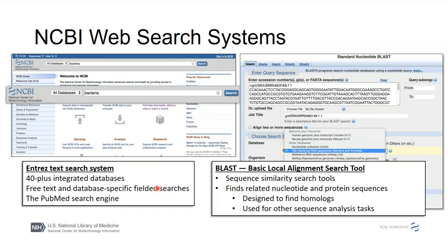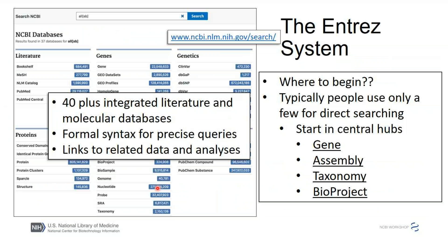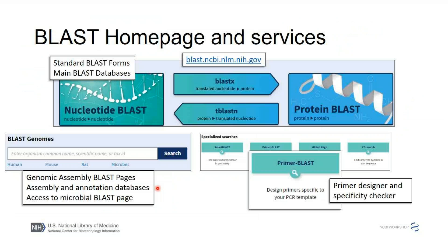You can search Entrez all at once with the URL ncbi.nlm.nih.gov/search — though it can be daunting because there are more than 40 databases and you could potentially get hits in all of them. Typically you want to start in one of the central databases: Gene, Assembly, Taxonomy, or BioProject.